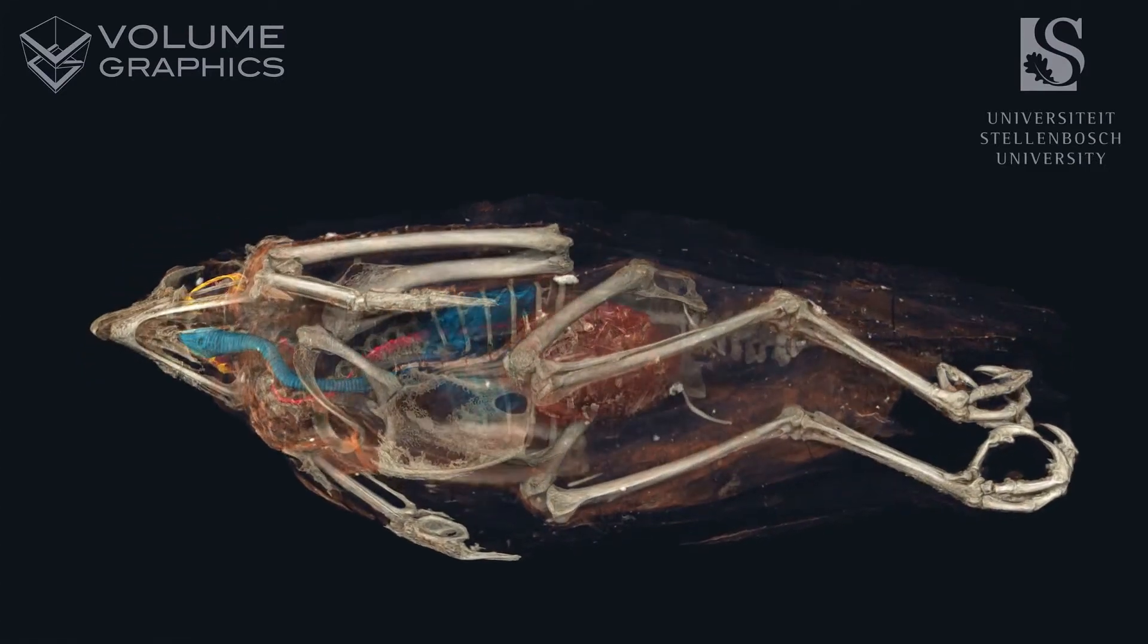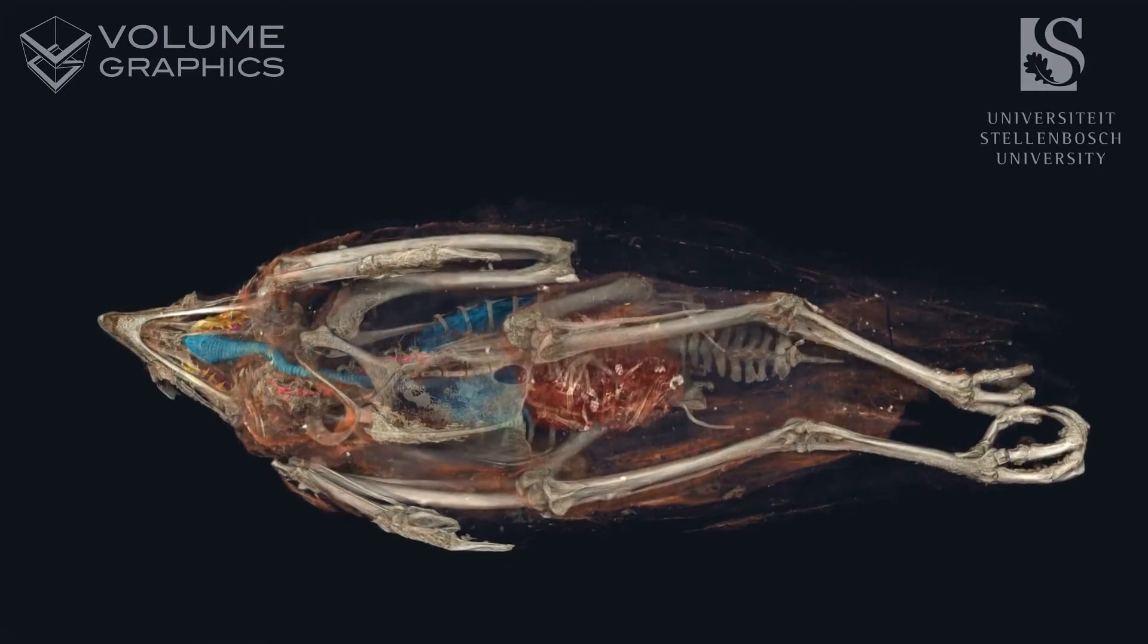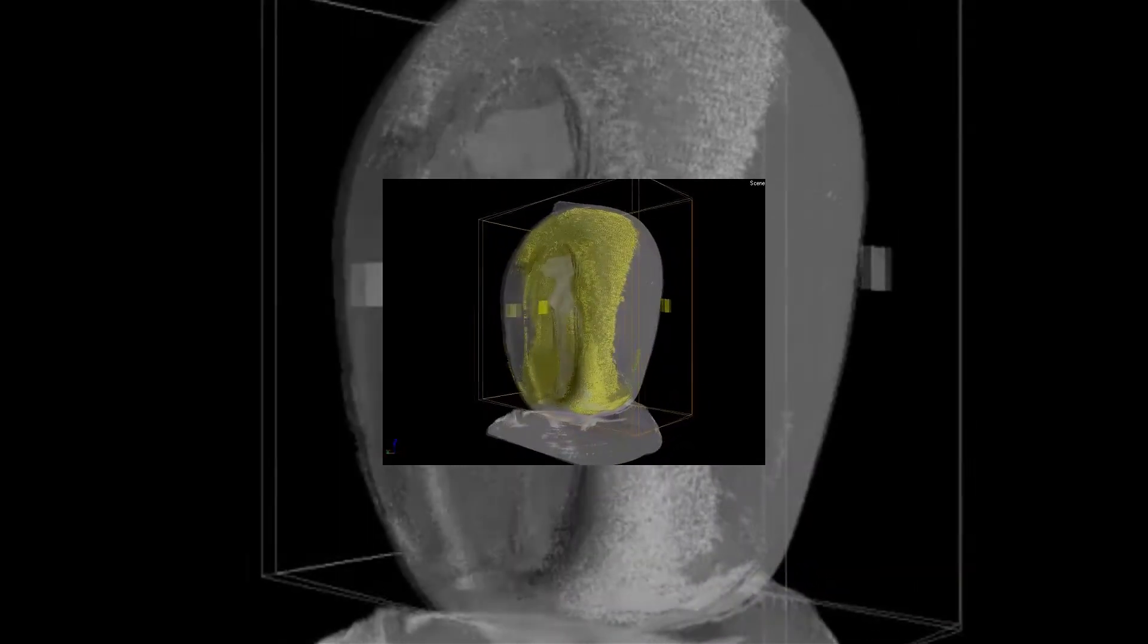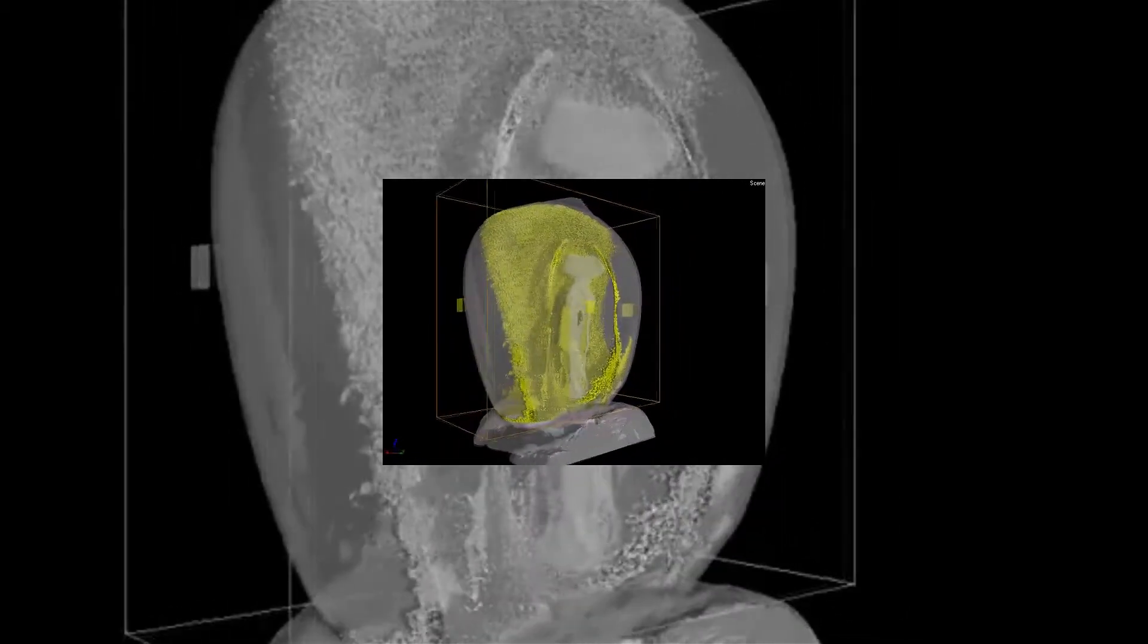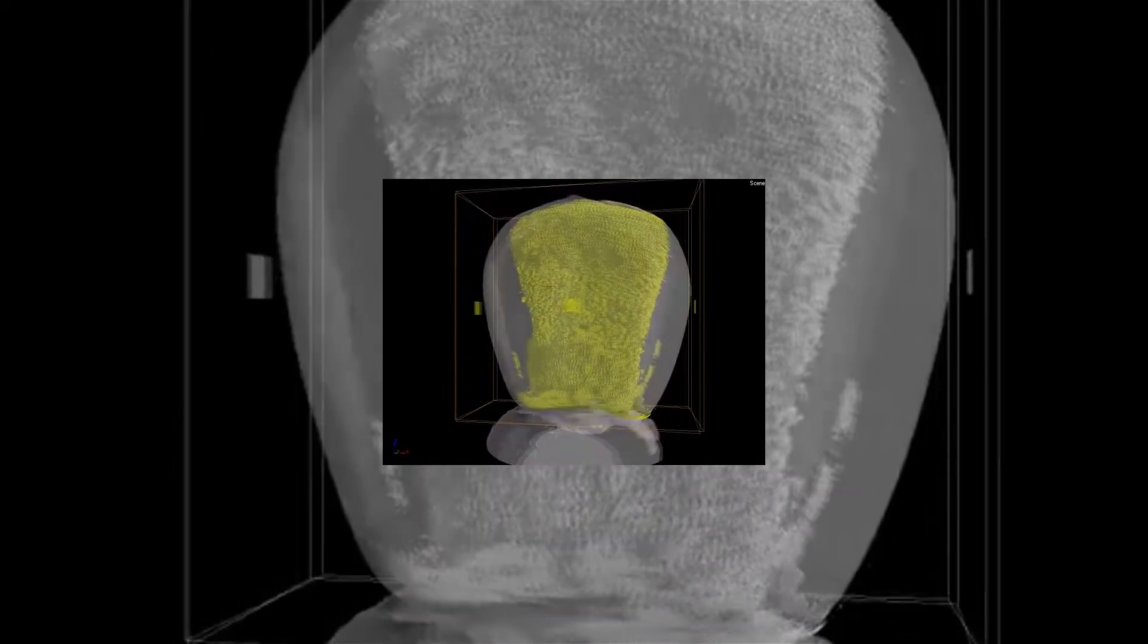Within food science research, we mainly use x-ray techniques to evaluate and analyze whole cereal grains and especially maize kernels. The useful thing of using x-ray is in the first place that we can get 3D volumes, so we can look at the kernel as a whole. And this technique then allows us to see what happens inside the kernel that's not possible with any other technique.